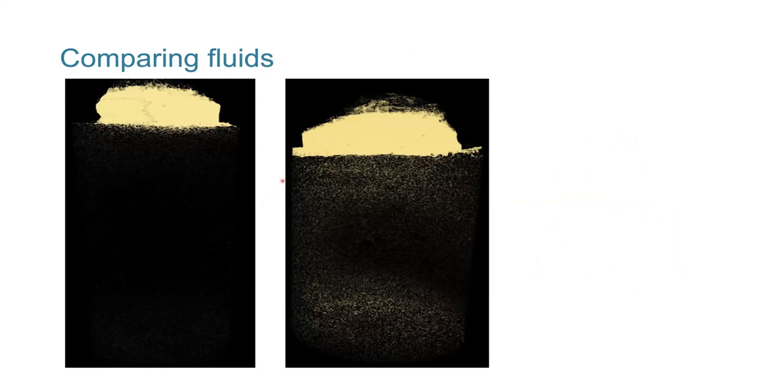On the right-hand image, we had a bad result because we could see there was change going right to the bottom of the sample. This is an example of the question of how deep is the invasion. Here we can answer. There's invasion along the whole length of the core sample here, and it's actually pooling in the back end of the sample because filtrate is getting trapped and it's not flowing away. Filtrate's been removed from the near wellbore during production, but not from deeper into it. So here we can identify deeper damage in the reservoir, so comparing fluids.